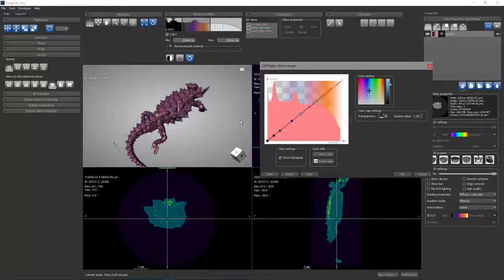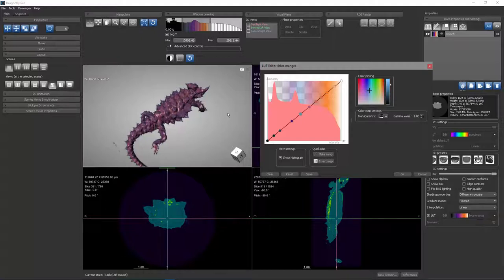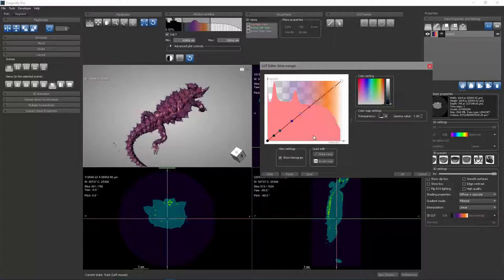So I could make that node bright blue if I wanted. Now you see there's a bright blue hue in some of these surface features on the Moloch. You can also take a node and choose to delete it. These nodes are referred to as keys.